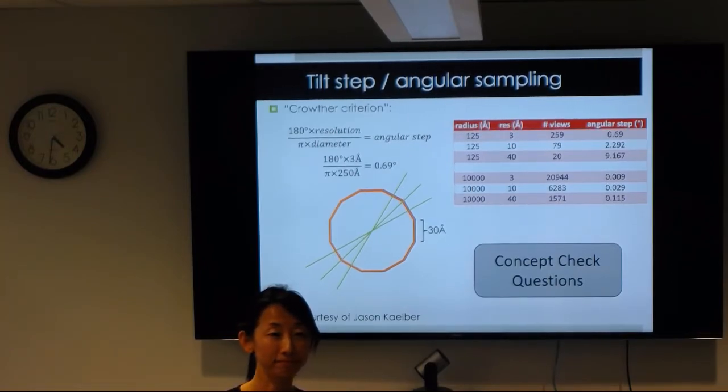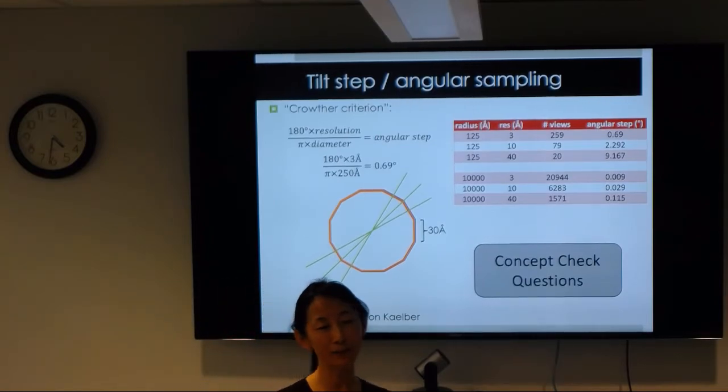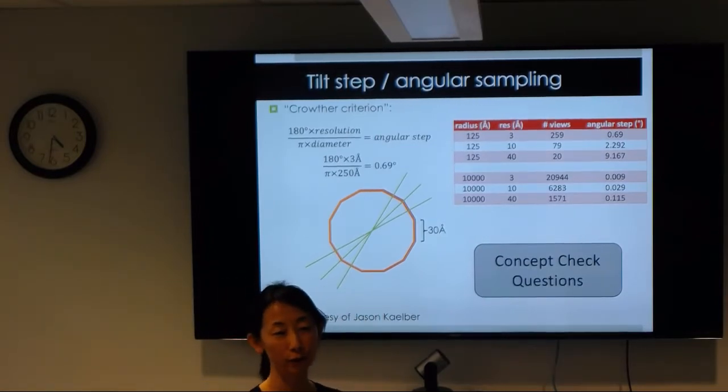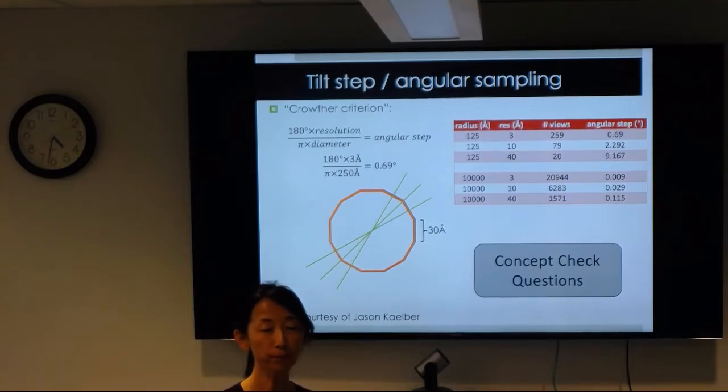Yeah, so once you have a general idea of what you're looking at, you can then do that. That's the key. If you know what you're looking for, then your target happens to have a very strong structural signature for you to find it, and it occurs in abundant enough numbers. Oh yeah, abundance. That's why doing ribosomes is really good, because there are a lot of them. But there are a lot of protein targets that in bacterial cells you might only have a couple of proteins inside whole bacterial cells. Like this one, they have only a couple of tubes per cell.